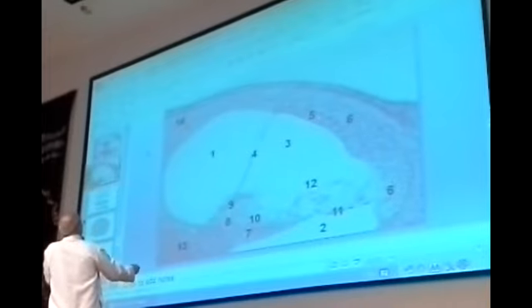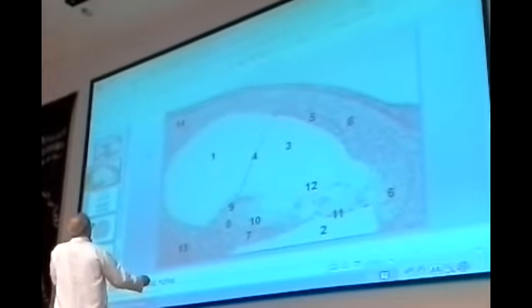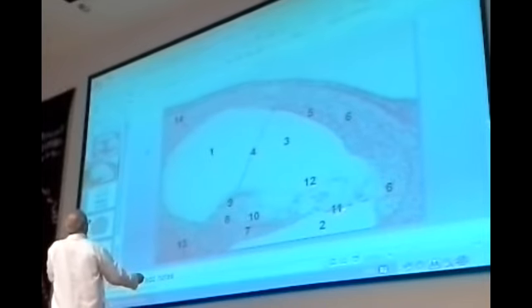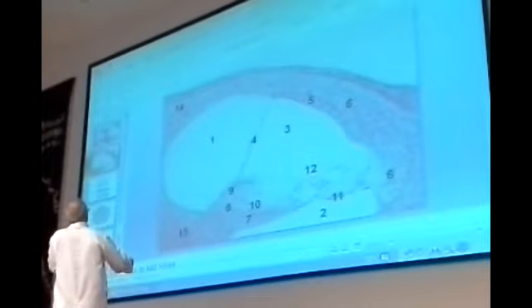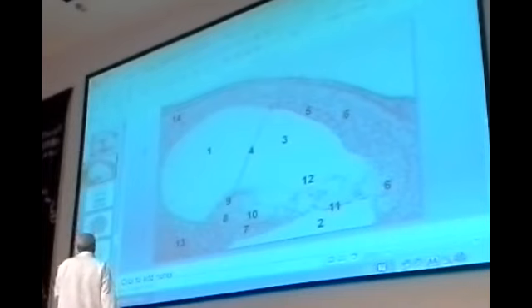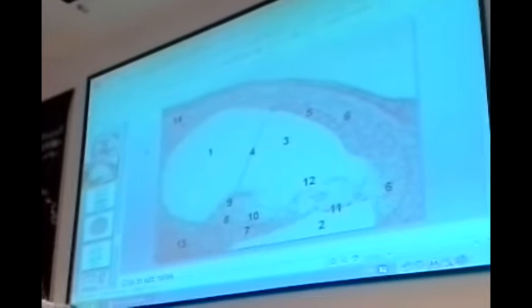Where you can find the vascular epithelium in the ear? Stria vascularis. Here it's stratified vascular epithelium. What connects the spiral ligament to the osseous spiral lamina? Number 11. Basilar membrane. Where you can find the spiral ganglion? This is the spiral ganglion. Cells. Number 13. Spiral ganglion cells.